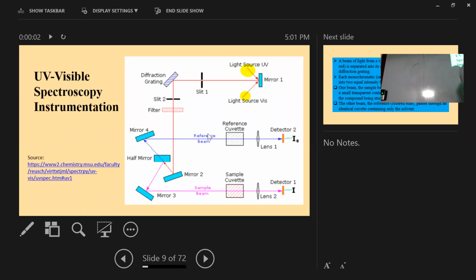I have one very simple thing. This is a plastic, and if you see the light intensity, this is normal. That means this is when we are passing the light. Here we have solvent. If we have solvent and solvent, all of them the same, then you will see just this bright light.